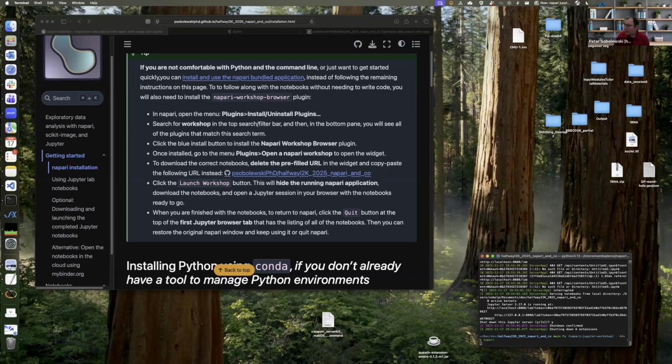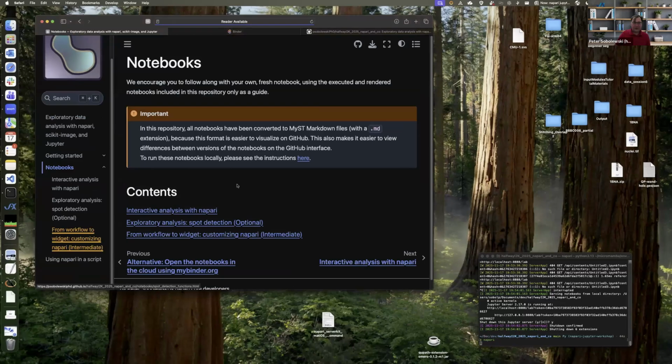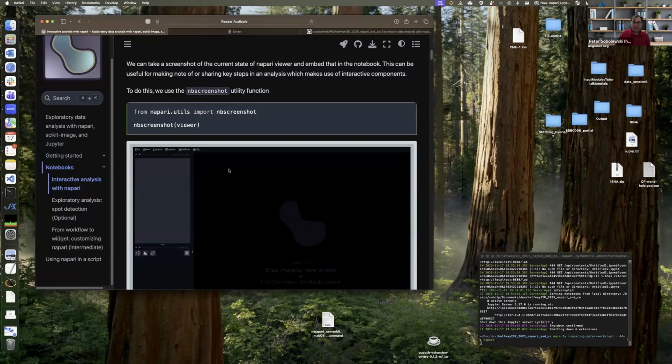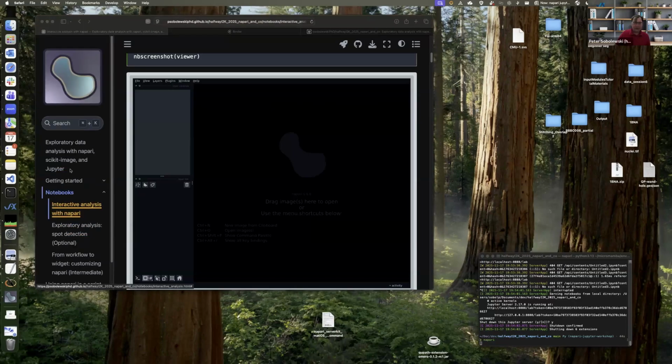Cool. All right. And then if getting it installed is a problem and you don't want to install it, that's fine. You can, well, let's see if this Binder is working. No, still working. Everything is solved in the notebook, so you can just basically see and follow along with what I'm doing. Also an option.